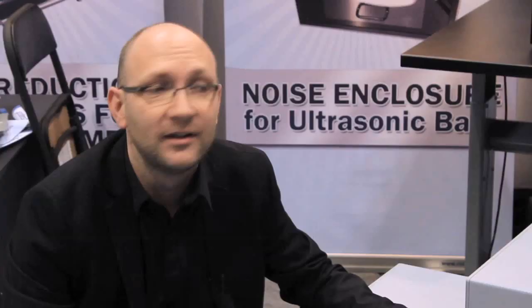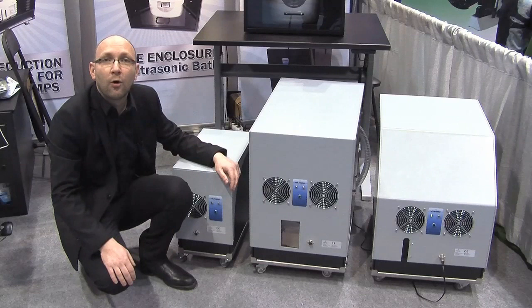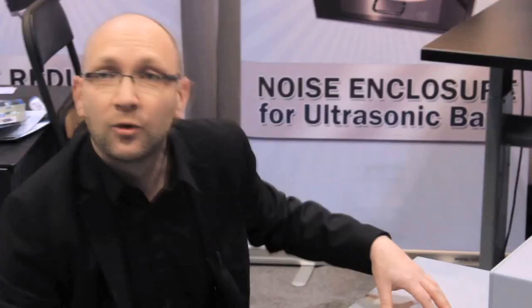Most of our market is in the field of mass spectrometry instruments. There are more and more mass specs in the lab and they come with noisy vacuum pumps. So we designed a product range to cover all the needs of vacuum pump noise issues in the lab.